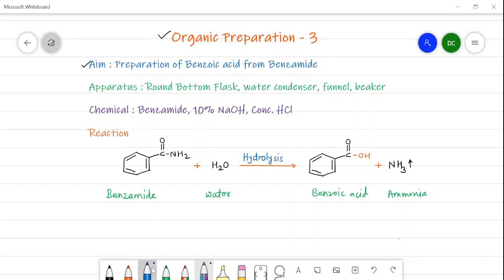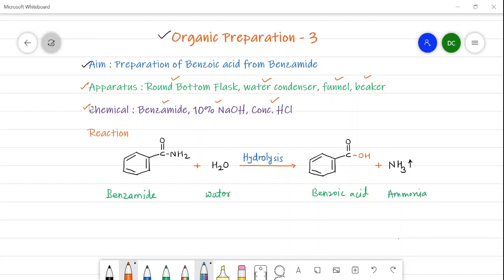The chemicals and apparatus required for this organic preparation are: round bottom flask, water condenser, funnel, beaker, benzamide, 10% NaOH, and concentrated hydrochloric acid. These are the apparatus as well as chemicals needed.